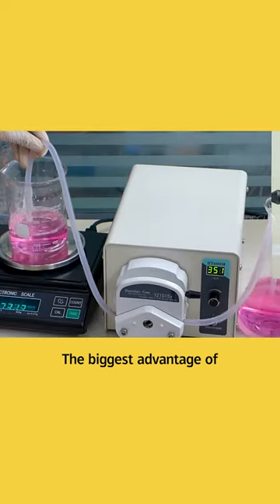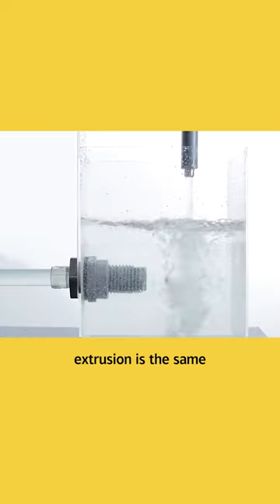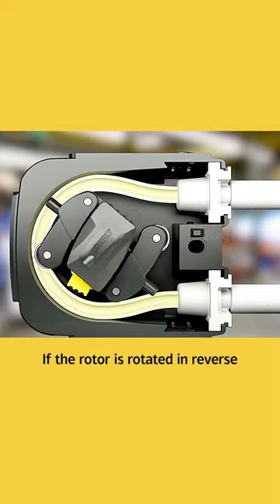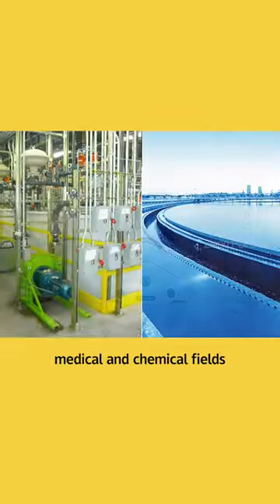The biggest advantage of peristaltic pumps is that they are sterile, hygienic, and safe. The liquid volume transmitted by each extrusion is the same, providing accurate and controllable flow rate. If the rotor is rotated in reverse, it can also transmit liquid in both directions — very suitable for medical and chemical fields.